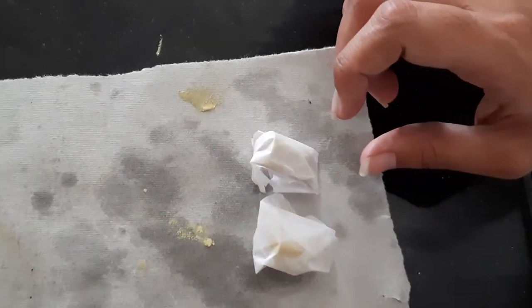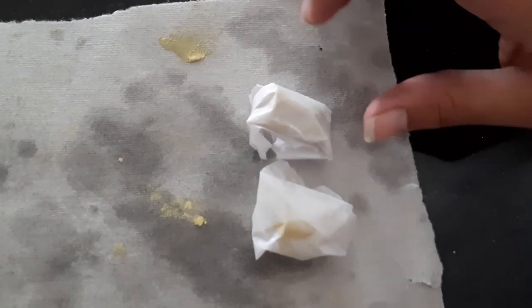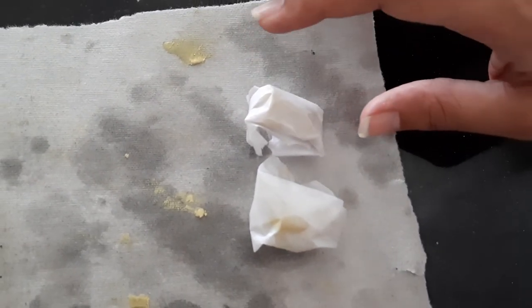The suppositories are wrapped. Place them in a suitable container, label it, and dispense.